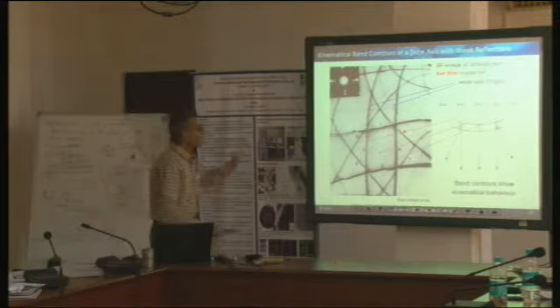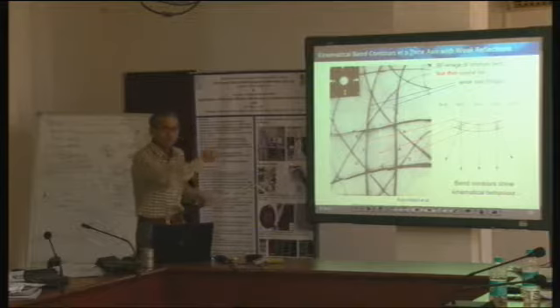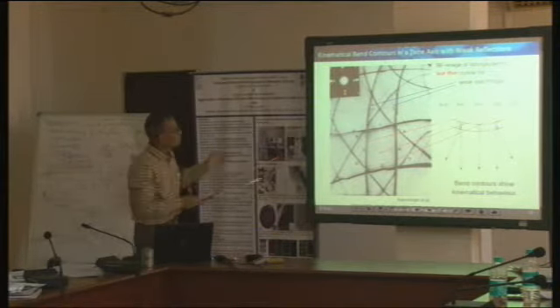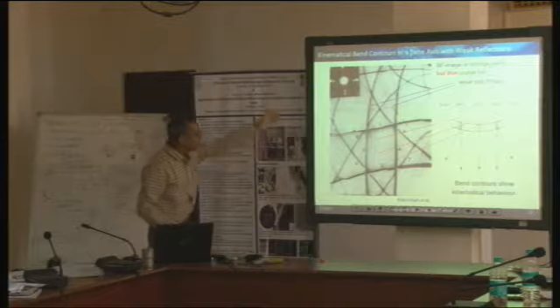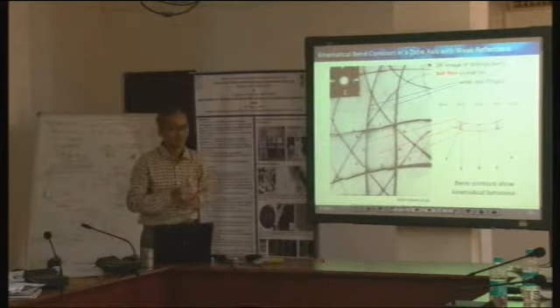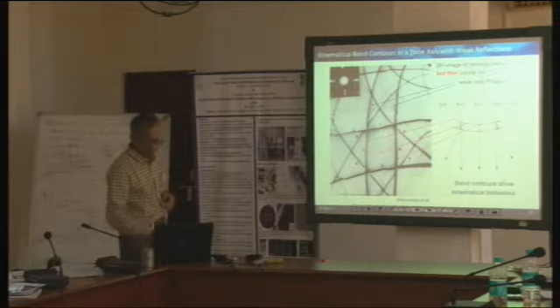See, now I have this image. This is a bright field image. I feel like I am looking at the sample, from common sense. I can probably understand that this is a thin region, this is the hole, or whatever. But the information which is here is very difficult to interpret. That's the problem, and I can easily tell you why.